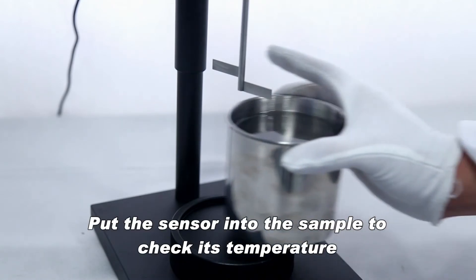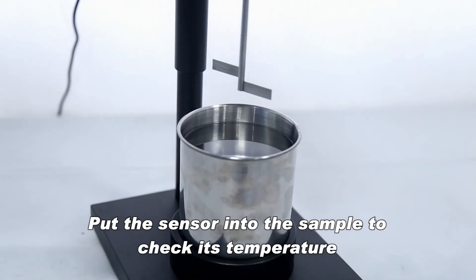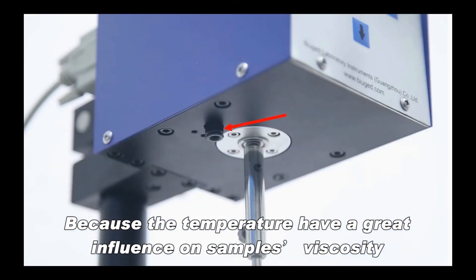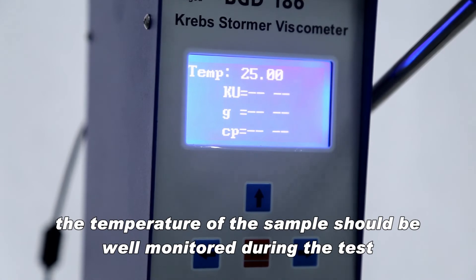Put the sensor into the sample to check its temperature. Because temperature has a great influence on sample viscosity, the temperature of the sample should be well monitored during the test.